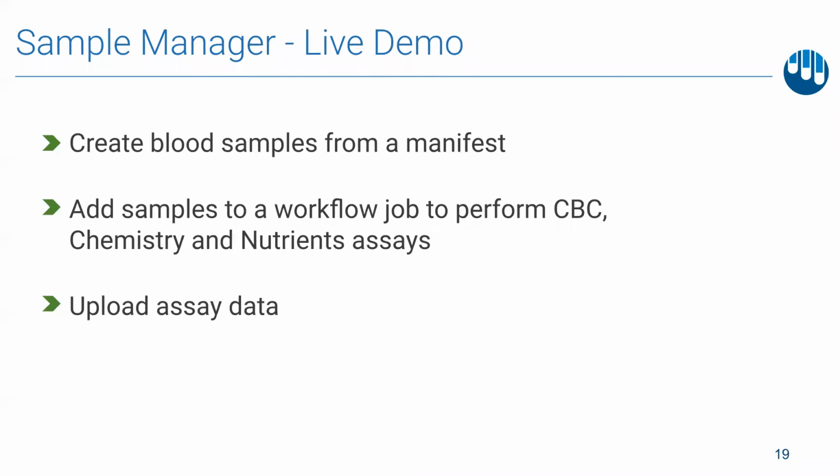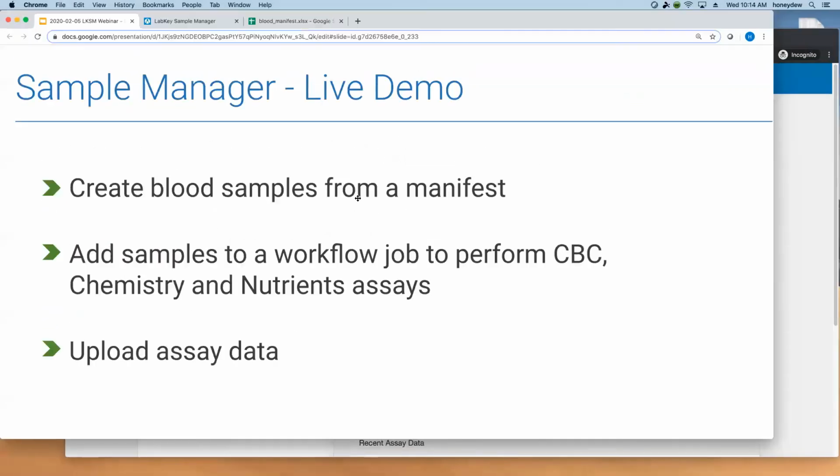So now that you've heard about how Sample Manager can help in your lab, it's time that I show you. For my live demo today, I'm going to pretend I'm back in the lab, responsible for receiving our blood samples and generating the necessary data associated with those samples. In this lab, after the blood is received, we'll want to analyze the samples for complete blood count, chemistry, and nutrients, and upload that associated data. I'll switch over to our live demo.